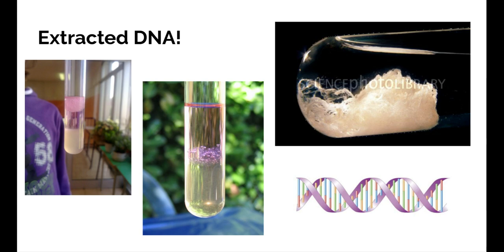And then, as I said, you can kind of see it in the most leftward picture, but if you actually pull that out of solution, it starts to sort of condense and coagulate a lot more and looks more like mucus and less like a cloud of lace. So it's just a little interesting difference.